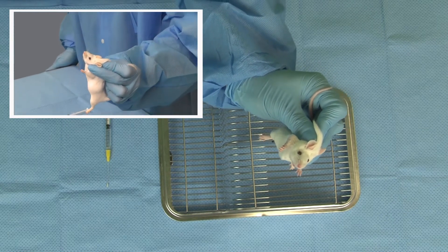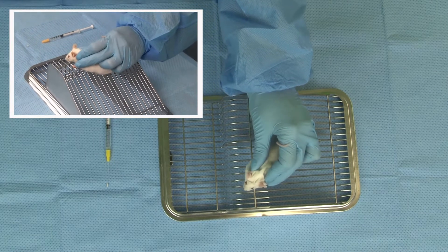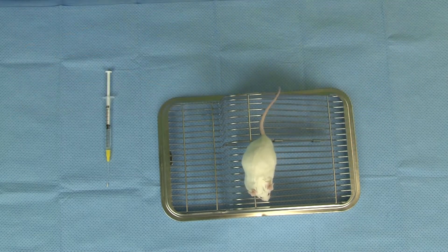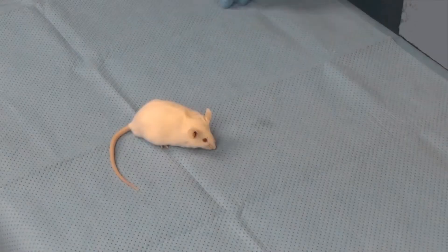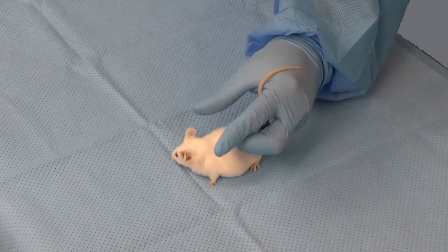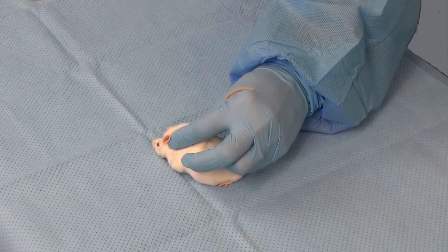Be sure to lift the mouse off the surface so that the mouse cannot use its back legs for leverage. Here is the same restraint technique from another angle, demonstrating how the middle finger is used to stabilize the mouse's neck and head.